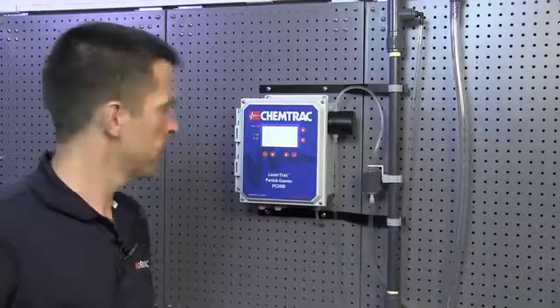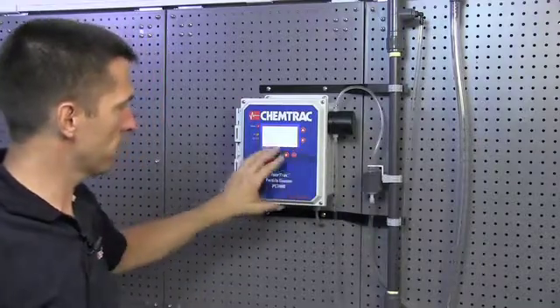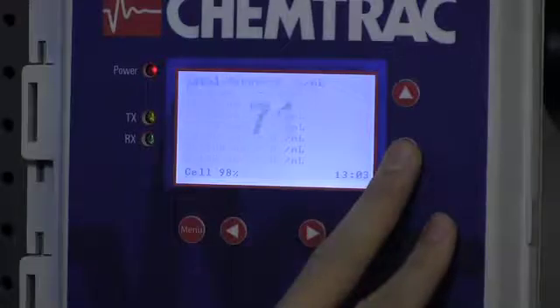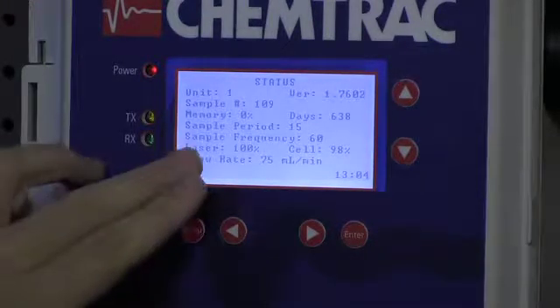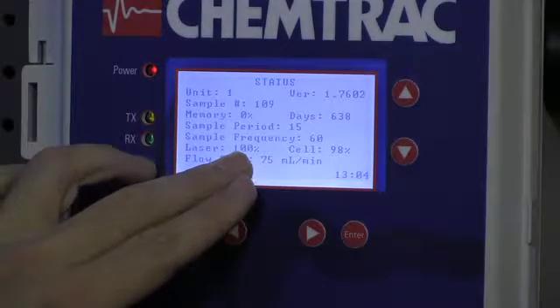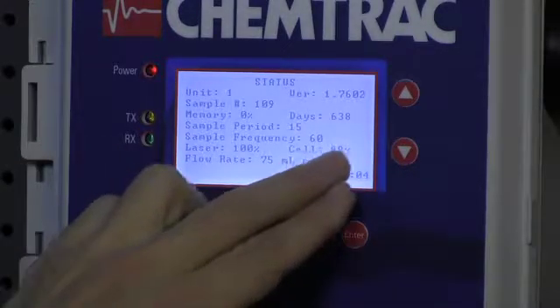Before performing calibration, we'll need to clean the sensor. When we go into the display of the unit, if we hit the down arrow next to the display two times, we come to the status screen. Here we can see the laser percentage, which is at 100% on this unit, and the cell percentage, which is at 98%.